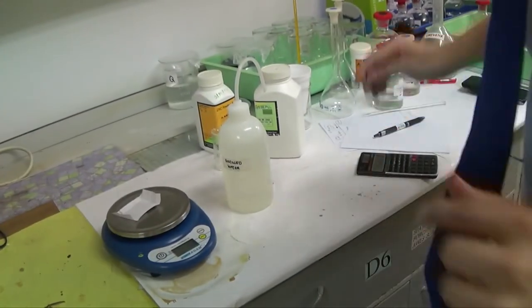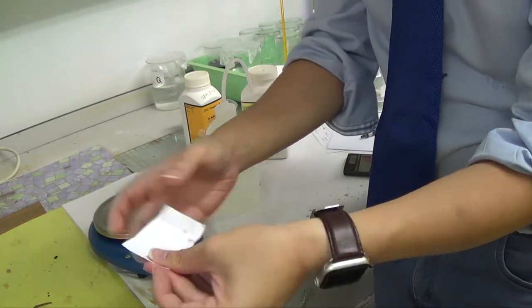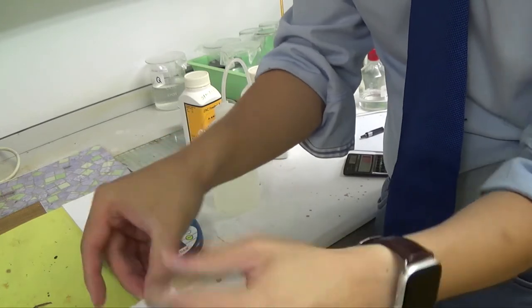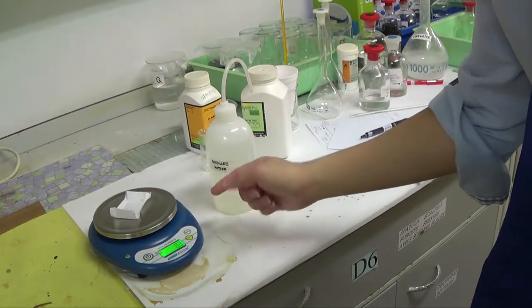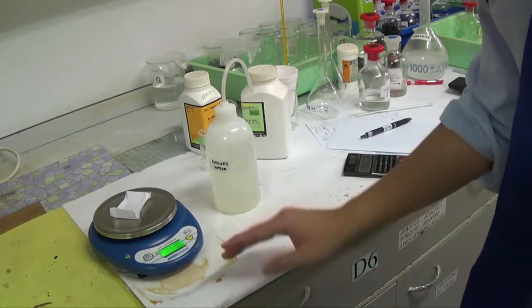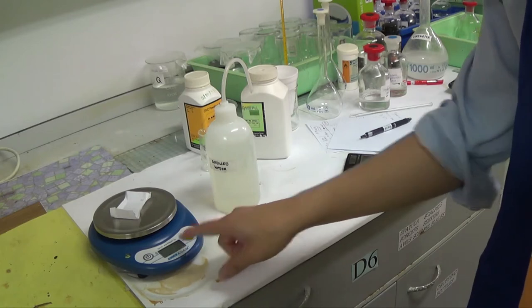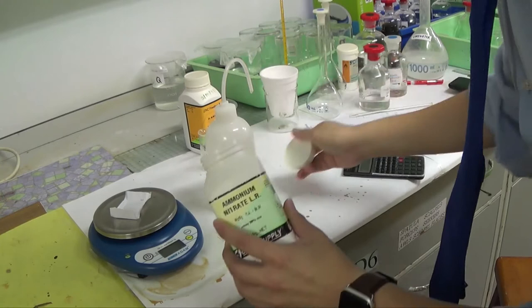So the first step in making a stock solution is calculating the mass of solid needed for your target concentration, then weighing it. I've folded a piece of paper into a weighing boat — with walls on the sides so the solid doesn't tip over — and placed it on the balance. I press zero to tare it so it starts at 0.0, meaning whatever I measure next will be just the solid.